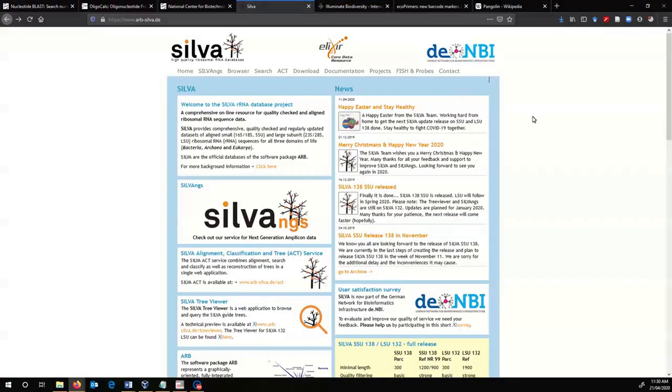So other ones that you can use, of course, are the ribosomal RNA genes. There are some in mitochondria, which do evolve at a similar rate to the barcoding of life CO1 gene. So you can use the 16S region or the 12S region in mitochondria, and you can have primer binding sites that are conserved and will allow you to have some certainty that you're going to amplify the things you want to amplify. For more slowly evolving things like the tardigrade version, there's actually a whole database dedicated to this.